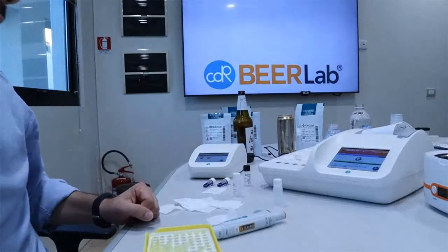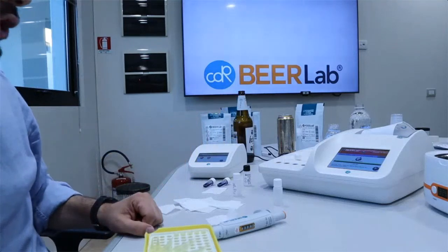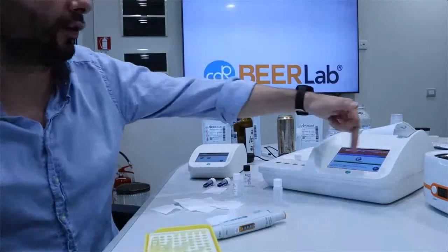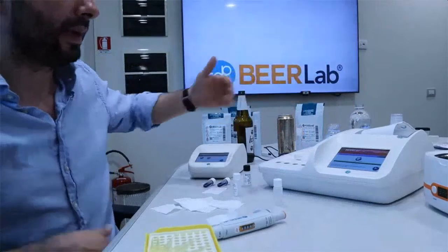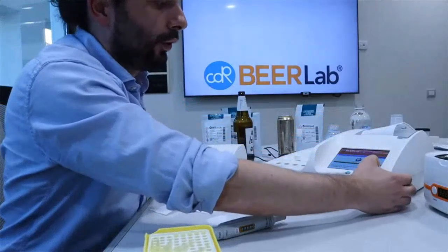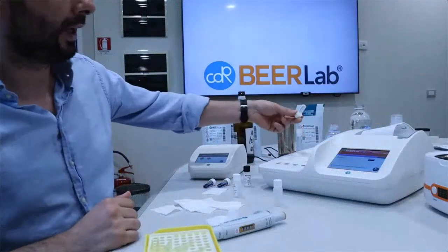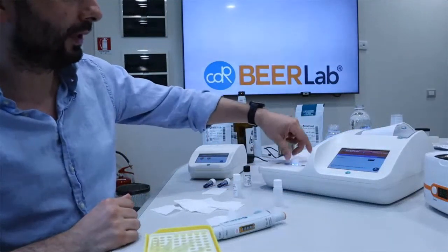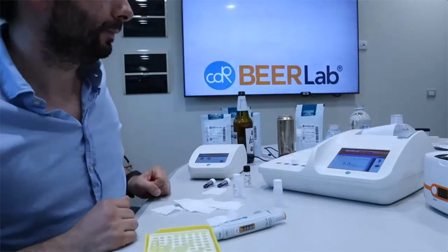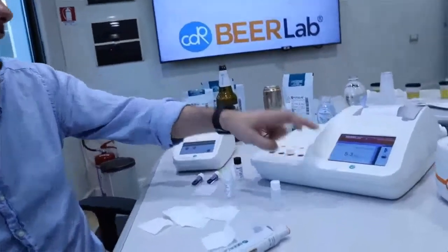Here we have finished the analysis, so we can finish it up. Okay, so we are again on the alcohol screen. After the 10 minutes, where you can talk, you can work, you can do what you want, we go ahead and we take the cuvette, we shake a little bit before the reading. We put the cuvette into the reading cell and we press. And we have the result. As you can see, we have 5.3.